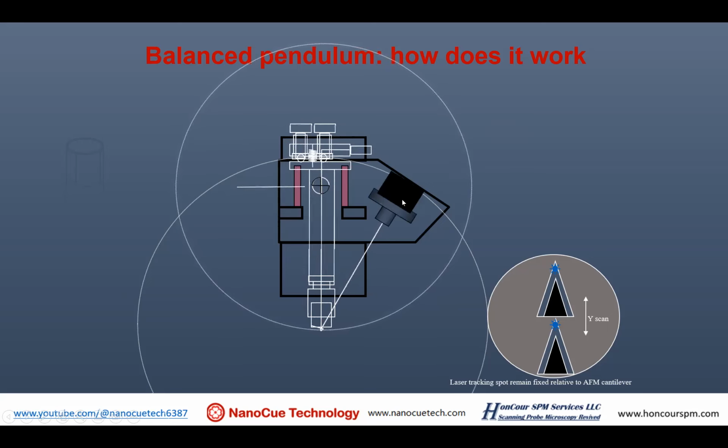And then we put a detector to detect the laser point. Okay. I want you to keep that picture in your mind. So when you adjust things, you know what it is you're adjusting and what kind of things you're aligning. That's what basically it is.